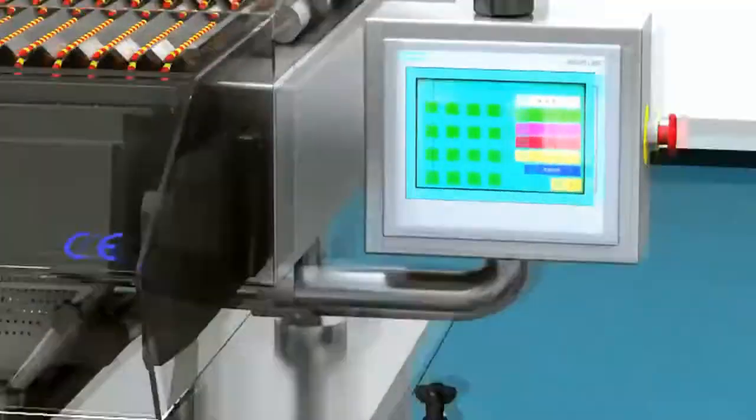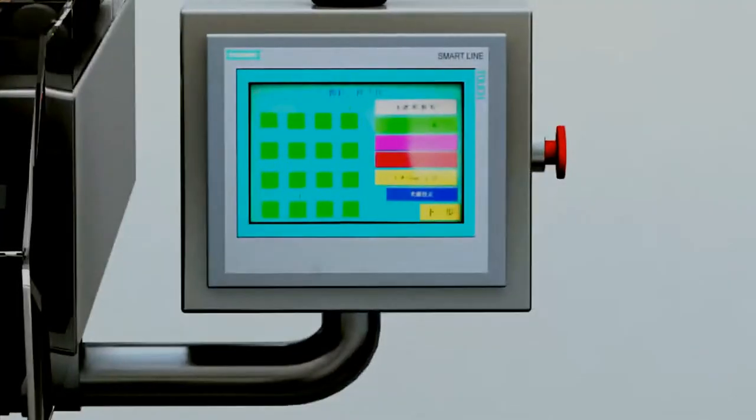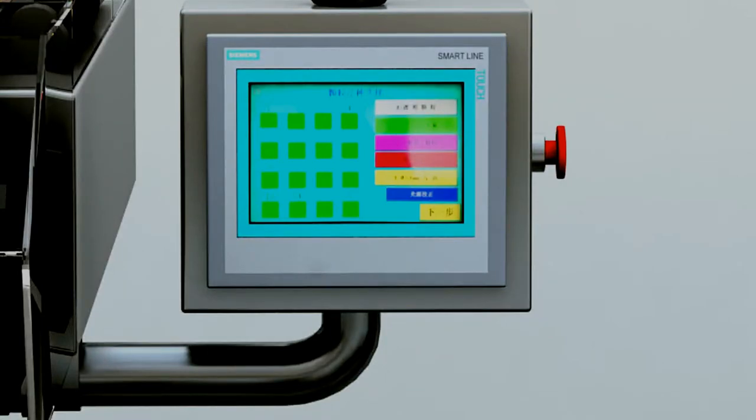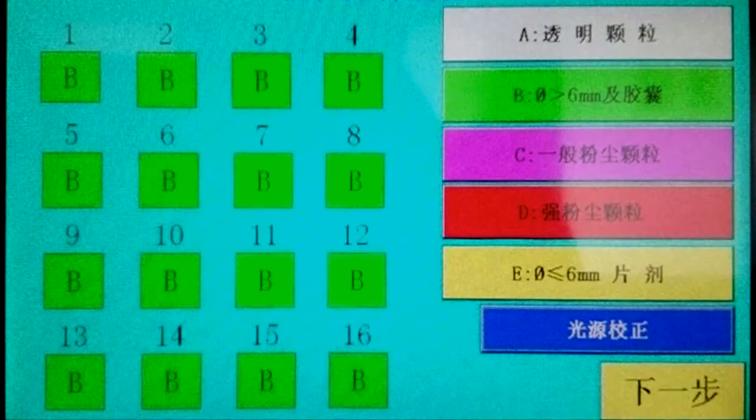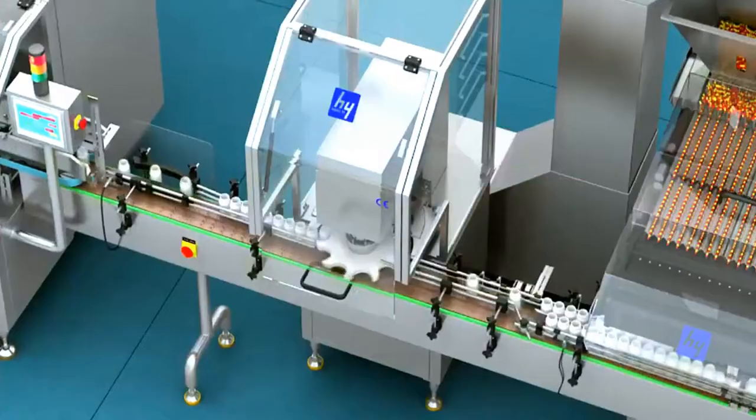It can be used in a large dust environment by selecting super dusty granule mode on the touch screen. For medicines of different types, it can select different image modes.